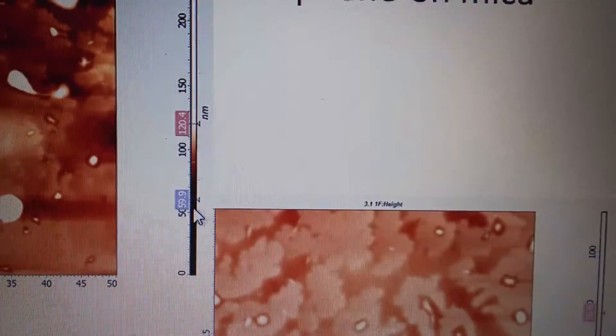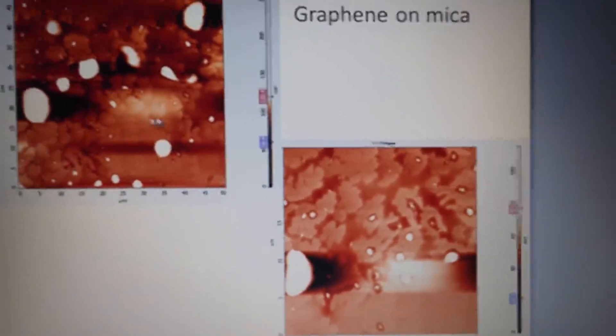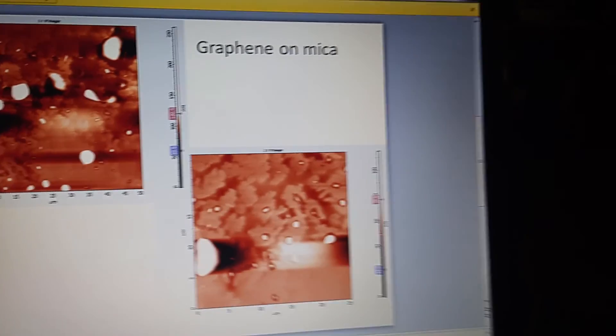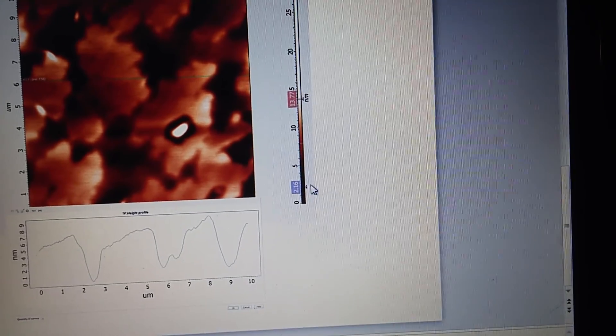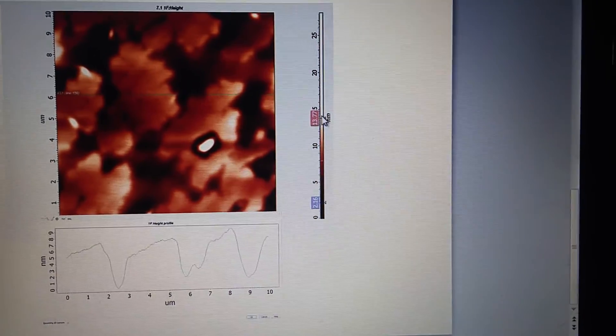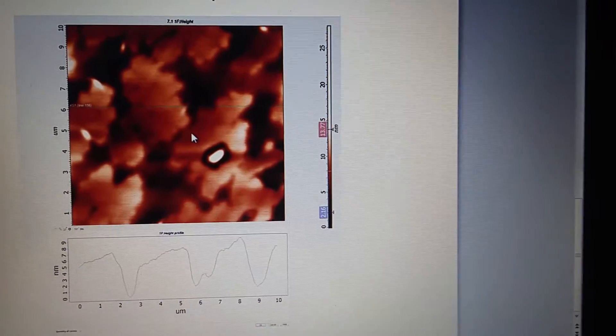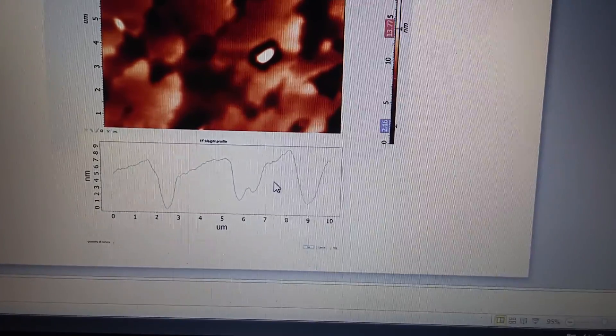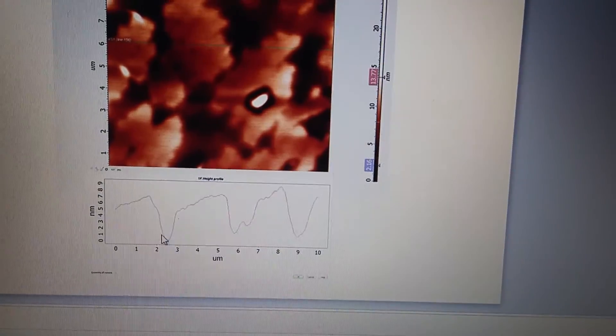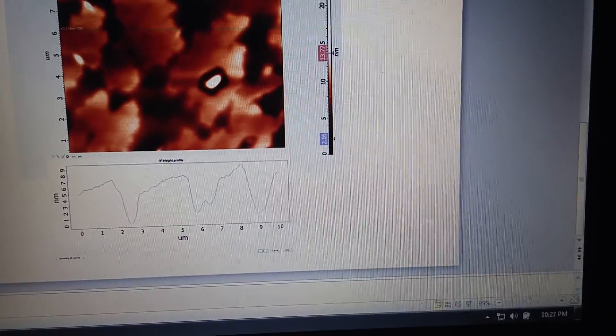So you'll get these bands of depth, and then here you go. These are actually the individual flakes, and that's like 2.16 to 13.77 nanometers, and that's how they're profiling. And if you can see down here, you can see where the edge down here, and it'll come up here. Now that can be irregularities in the mica or whatever, but it's not that big of a deal. But that's a good example to start with.